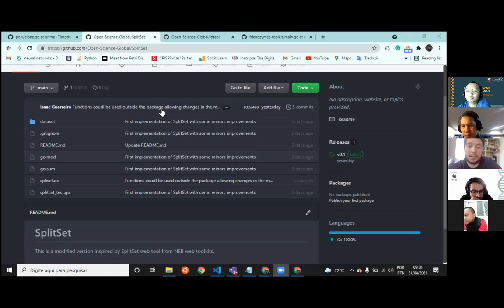And the next step will be to transform this in B. subtilis or E. coli. We will make the same thing, but now we'll make a sample for the host genome, and you make a protocol inside the OpenTron to run the transformation. We could use some protocols for transformation, like heat transformation, or, I'm trying to remember, electroporation. So the final result will be a sample where we created this transformation, and the final step will be plating the samples that are already transformed.